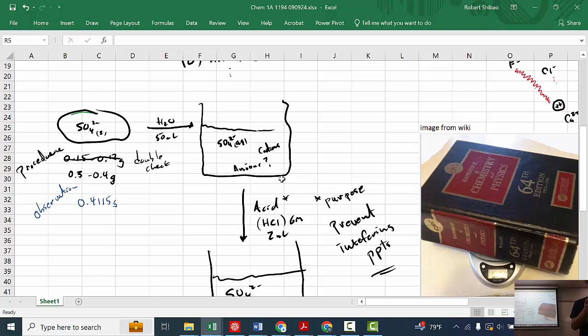What we're going to do is put the beaker on our balance and then tare it, that is, zero it. And then I'm going to tap some of this in here. So let me break this apart. And then this you'll have to twist open. Sometimes this lid is very tightly sealed. You want to keep this open a minimum time and then just tap some sample into the beaker. Actually, the beaker is going to be like this. Just gently tap it in. Hopefully you don't overshoot. If you overshoot, you might have to tap some back. And then you're going to weigh out anywhere between 0.3 and 0.4. It doesn't have to be exact. It's just going to be close.